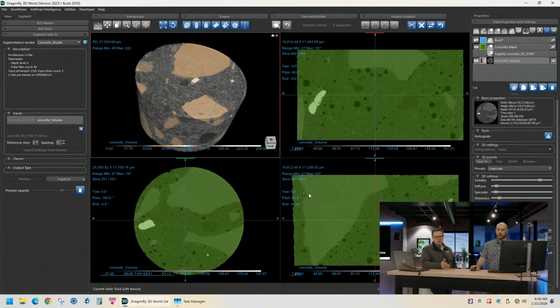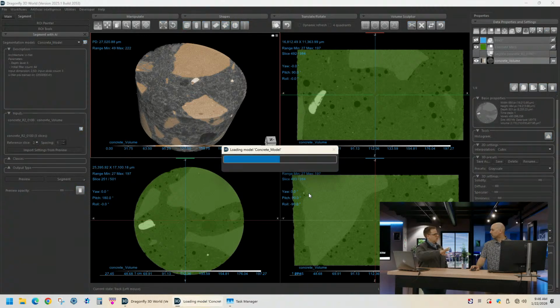And to create the mask, you can just go in and use those ROI tools that we looked at, or the painter. We actually talked about that on the last episode. Basically, what you would do is define range, identify material, and then right click on that ROI that you created, fill inner voids, and then it'll fill everything in. Then you just chose the model you wanted to use, which was the concrete one. And then what button did you hit there? Segment? So I did segment with ROI as mask, and I chose the concrete mask as my ROI.